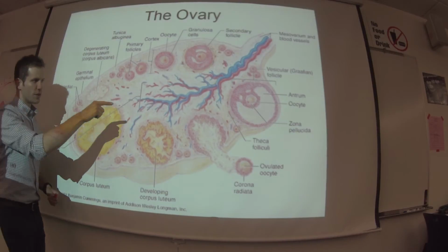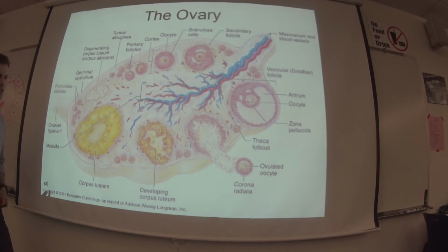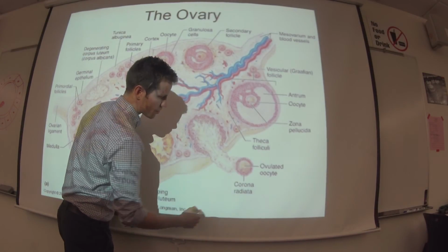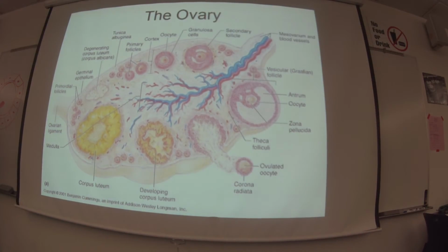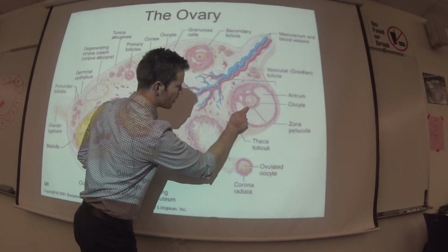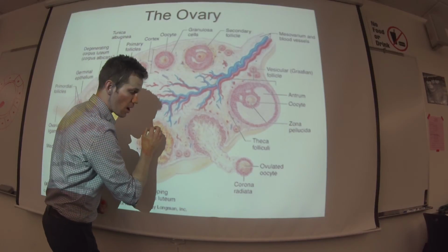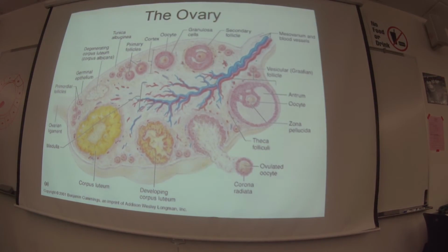The mature follicle is what's going to eventually ovulate the oocyte, as well as the cells that are still attached to it, which is called the corona radiata, the radiating crown. Those are still attached to the oocyte during ovulation. So they're right here. When it's a mature follicle, they're just surrounding the oocyte, but you actually ovulate both the oocyte and the corona radiata around it.